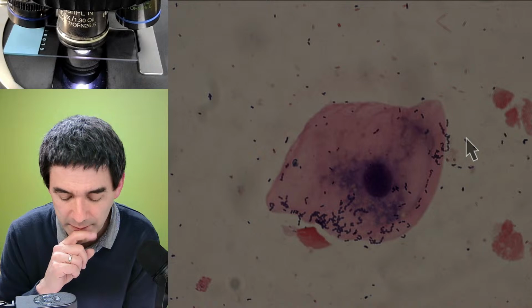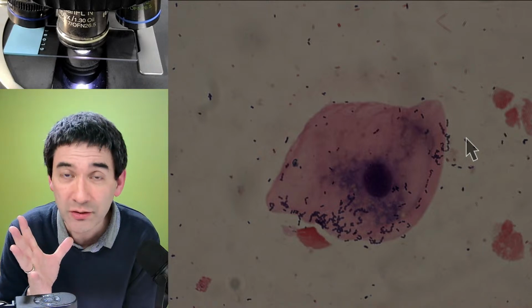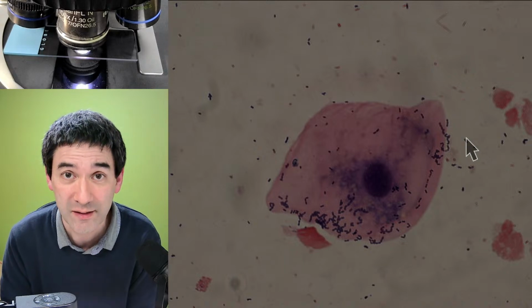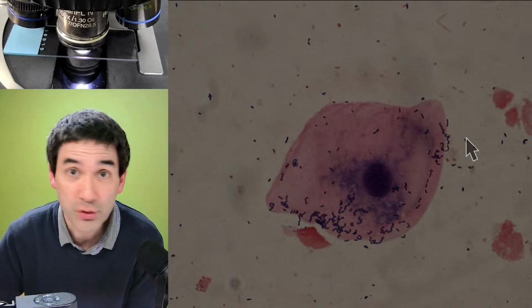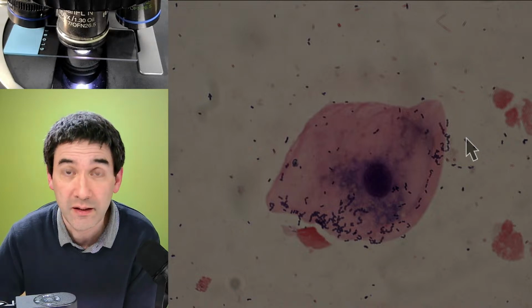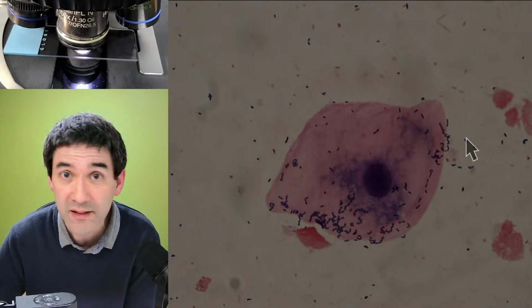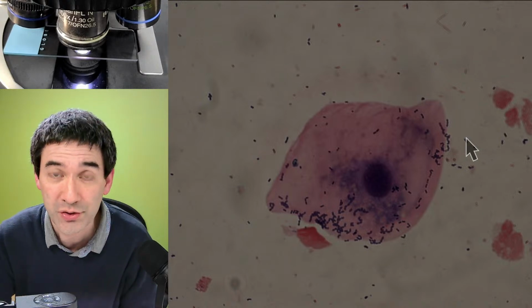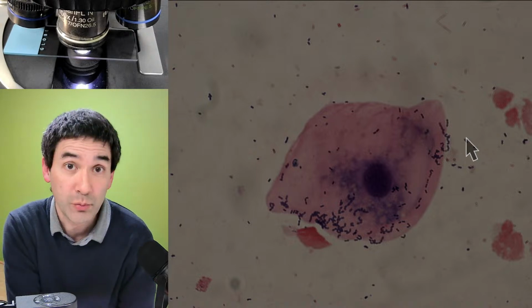However, the general answer, and this is how Gram and other scientists figured it out, is that they just tried it. This was purely trial and error. Back in the day, they obtained dyes and stains and simply tried them out. I think that's also something that I would recommend, and that's what I'm doing as well.